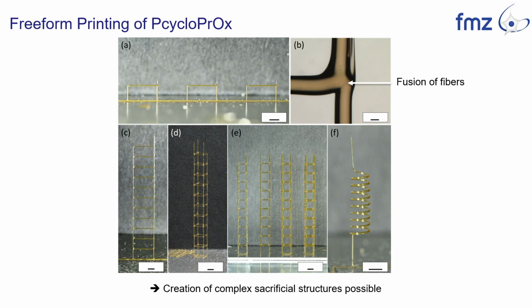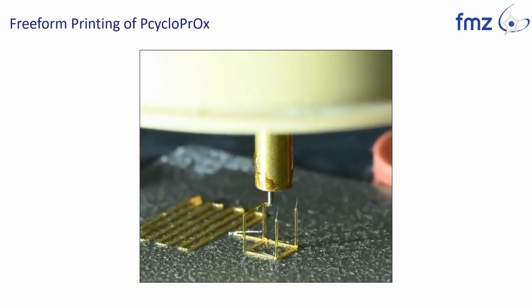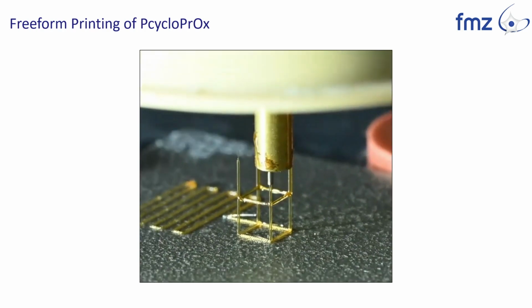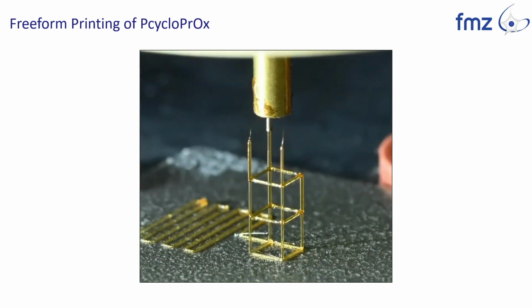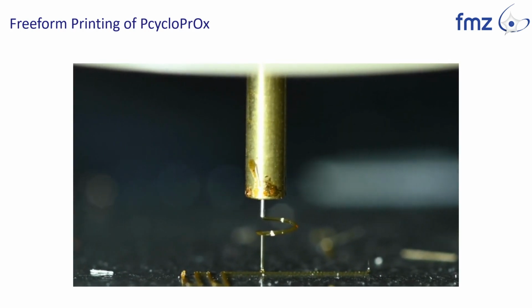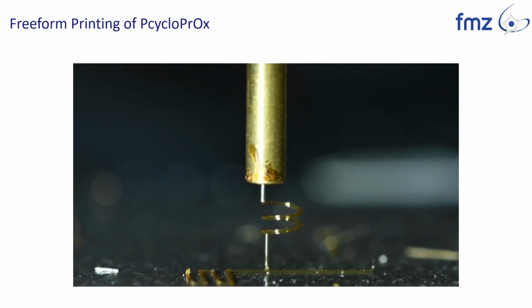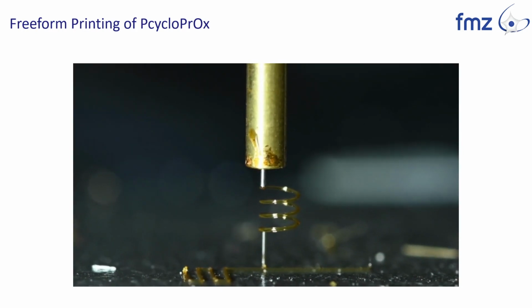On the next slide, this is a video which is 5 times faster than the printing process itself, and you can see that we are basically printing 4 pillars and then a plane of fibers, which is the basis for the next level. With this we are able to use the same materials but in a three-dimensional manner. In this video you can see the same but with the spiral. It's actually quite a sturdy material, as you can see, because this whole spiral is only fixed on this one little fiber below.